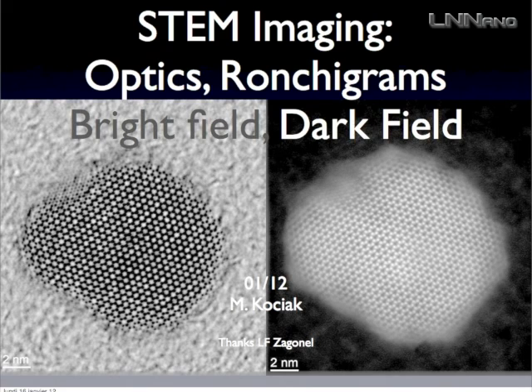He was very happy. So now if you look at the HAADF, the dark field image, it's more or less the same. Where you have a black dot, you have a white one here, but it's not the only difference. The other difference is that in some parts, for example here or here, where you have a very nice image, you can see dots here, but you don't really see them there. And this gives us information. I will come to this in a minute. And the second point is that there is some part where the image is much brighter here, for example, than there or there and so on. And this is linked to change in the thickness.